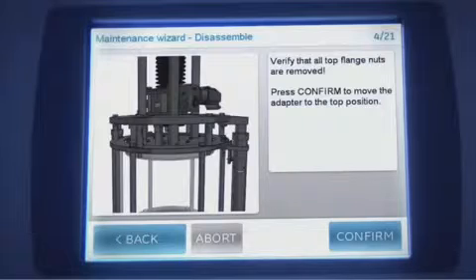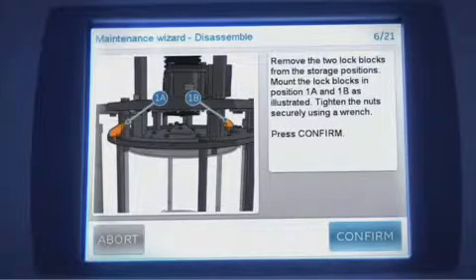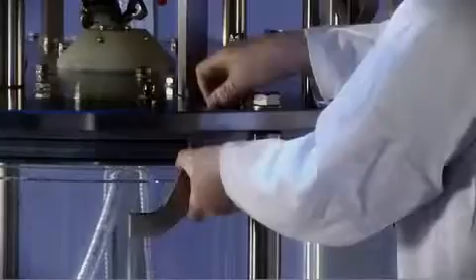After an action is completed, the operator confirms this on the AxiChrome Master before proceeding to the next action indicated on the display.